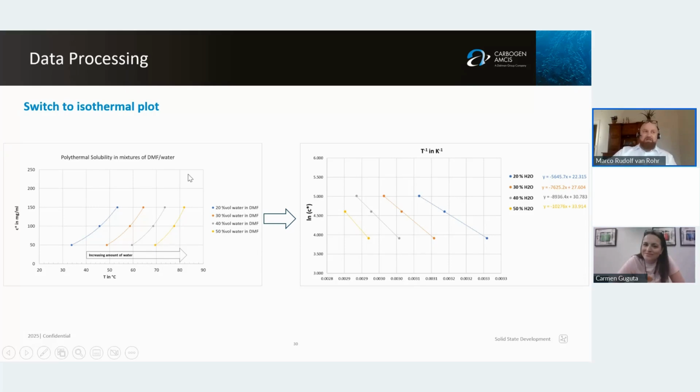It's also okay, but there's software available capable of that. You can use your classical DOE software, just use it a little bit otherwise and change the factors into parameters for your solubility data. It will give you nice contour plots. Excel is not that easy, but the DOE software typically can do that.